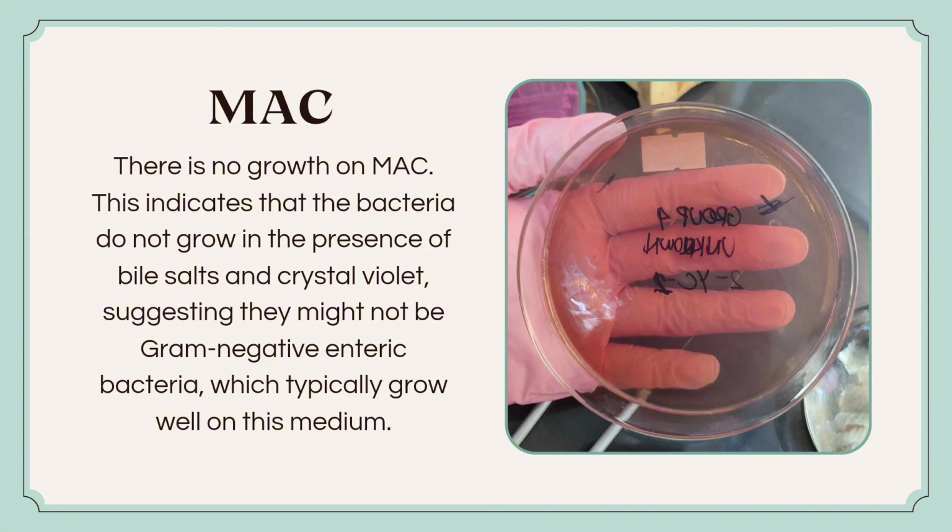There is no growth on MAC, and this indicates that the bacteria do not grow in the presence of bile salts and crystal violet, suggesting they might not be a gram-negative enteric bacteria, which typically grow well on this medium.